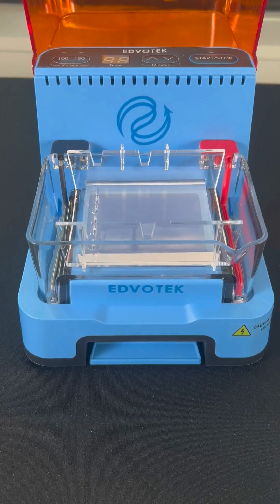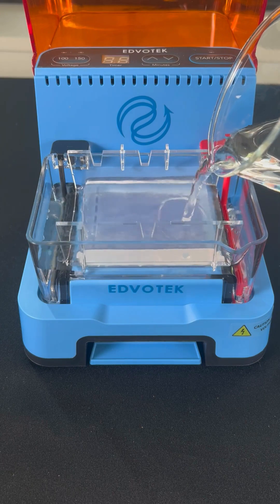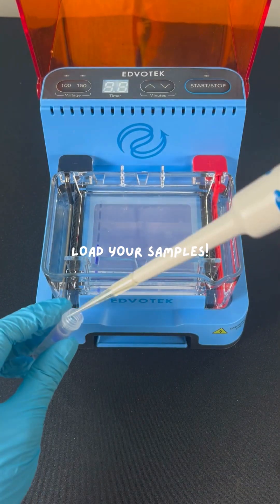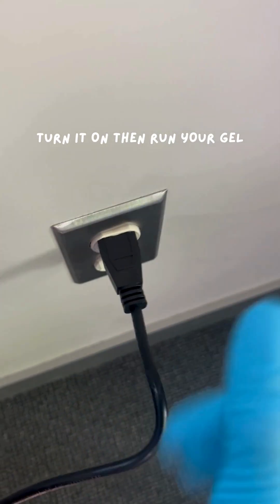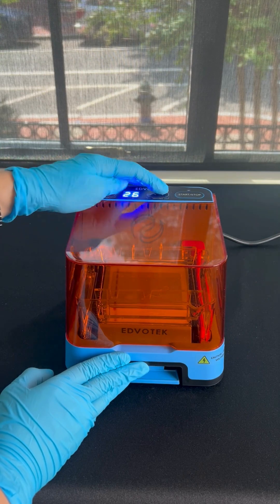Using your electrophoresis buffer, gently pour the buffer onto the gel so that it fully submerges the gel before you run it. All you have to do is plug it into the wall and you're good to go. I will run this at 150 volts for 25 minutes.